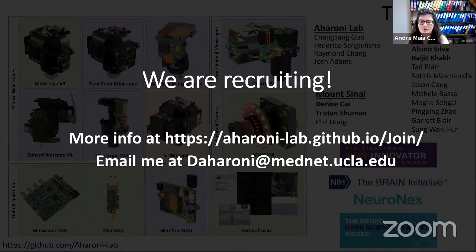So for some of the points you mentioned, photo bleaching and also the wireless aspect, Amon was asking whether there were any other calcium indicators that should be used or designed for long-time imaging, and also whether the wireless aspect was decreasing the stability of the miniscope on the animal's head.